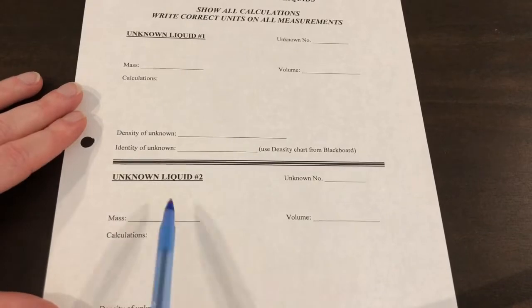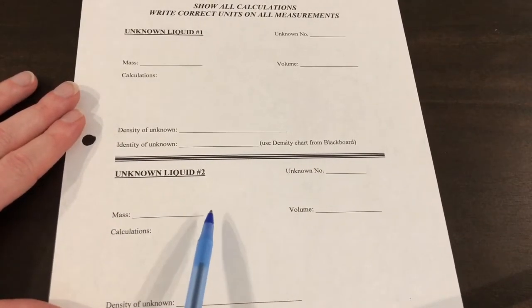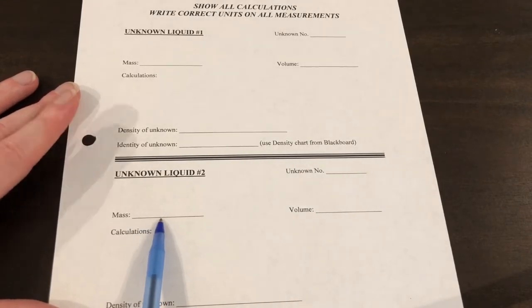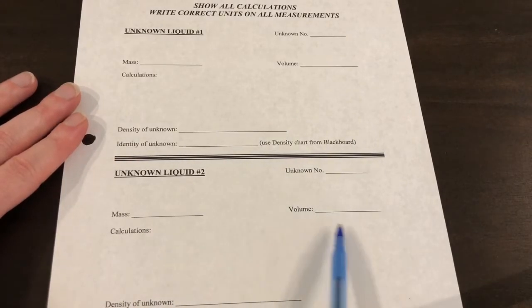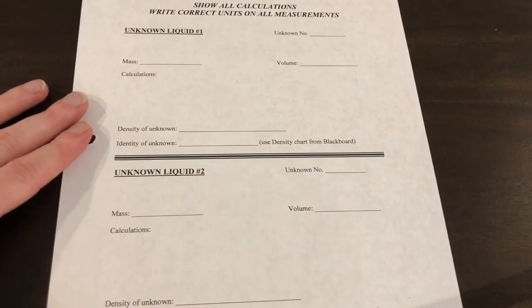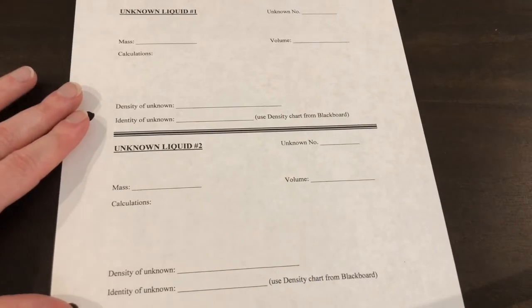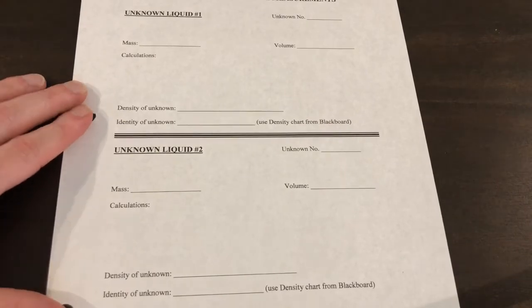Our unknown liquid 2 goes through the same process. Our mass is the mass of the liquid and the graduated cylinder minus the mass of the graduated cylinder. The volume we read from the graduated cylinder. We get that information from the video. The density of this unknown should be really close to the density of rubbing alcohol, or isopropyl alcohol.